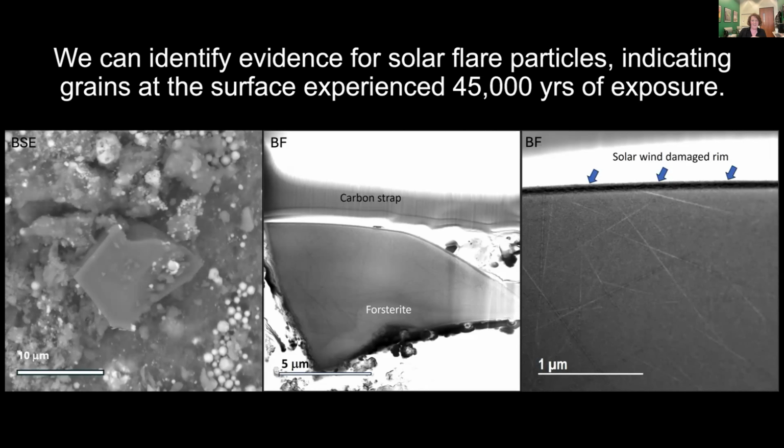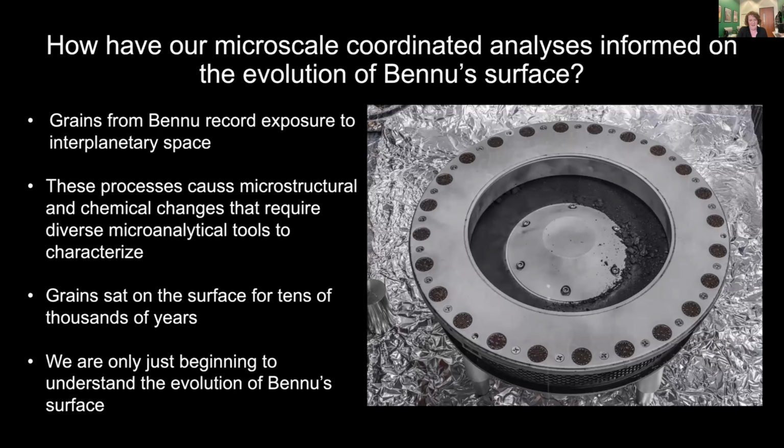So what does all of this data that I've just overwhelmed you with tell us? Well, this is our first asteroid sample return mission where NASA successfully brought back material from Bennu. Our first look at asteroid Bennu samples told us that they record their exposure to interplanetary space. We see evidence for micrometeorite impacts in the form of melt deposits, in the form of microcraters, and these nanoparticles that are forming distributed throughout the melt.